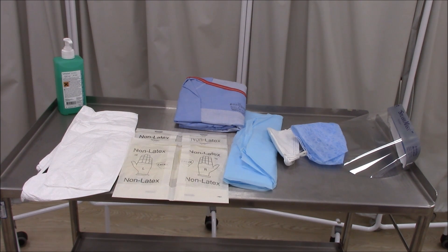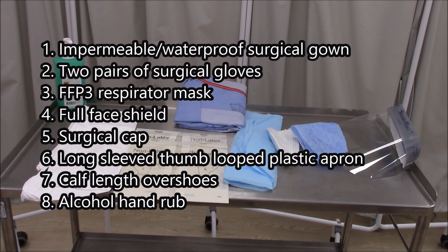The following disposable equipment is provided: an impermeable waterproof surgical gown, two pairs of surgical gloves, an FFP3 respirator mask, a full face shield, a surgical cap, a long-sleeved thumb-looped plastic apron, calf length overshoes, and alcohol hand rub.